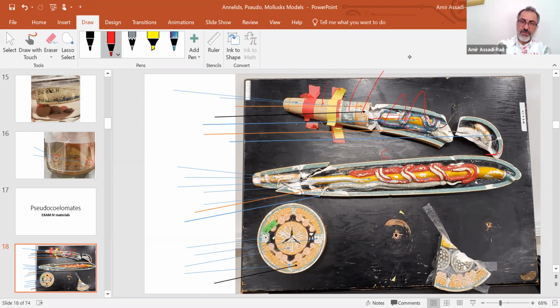So the cross sections through the pharynx, this is a pharynx right here, our longitudinal muscles, hypodermis, and cuticle. And of course, lateral line, uterus, intestine, longitudinal muscle, the bluish, darkish is the hypodermis, and then the outside is cuticle.